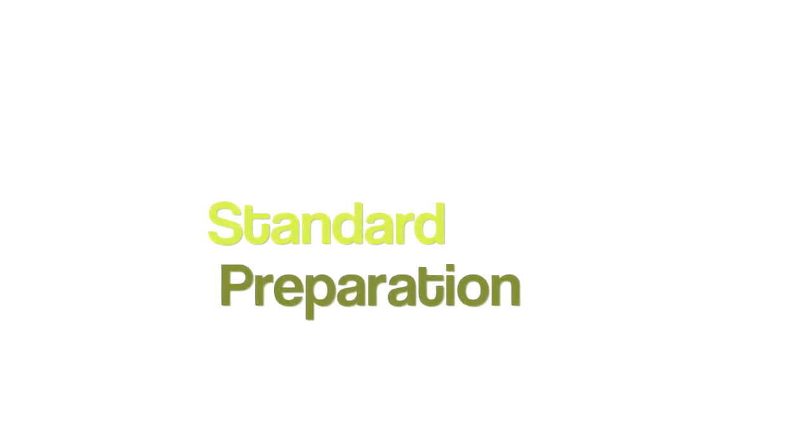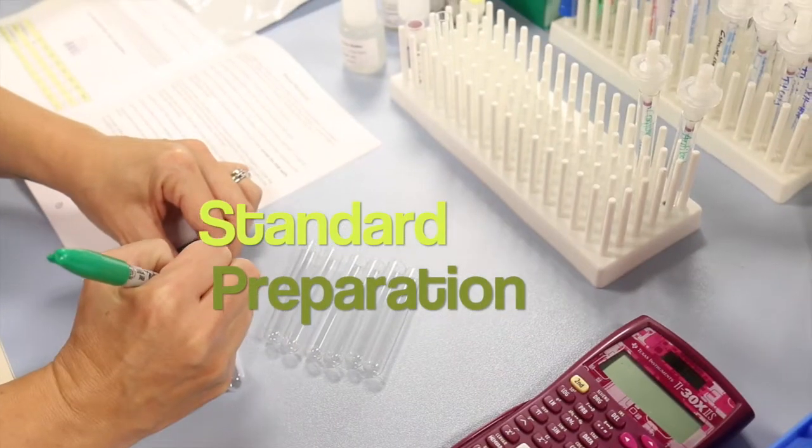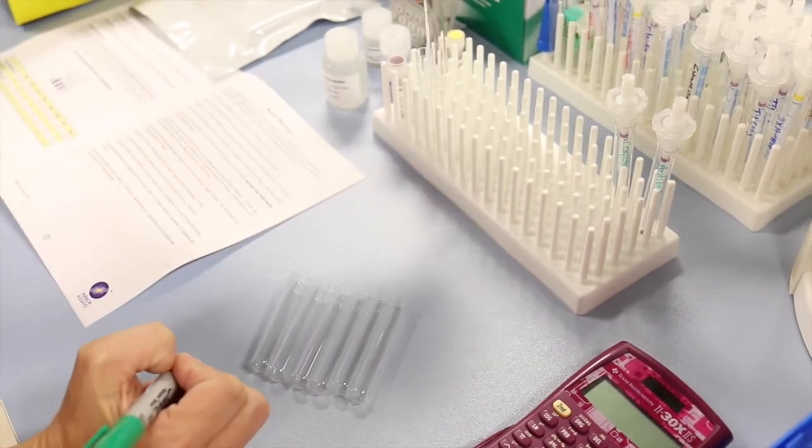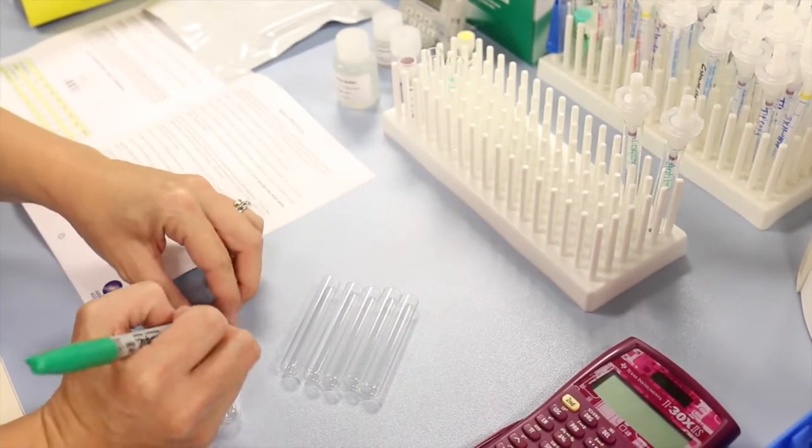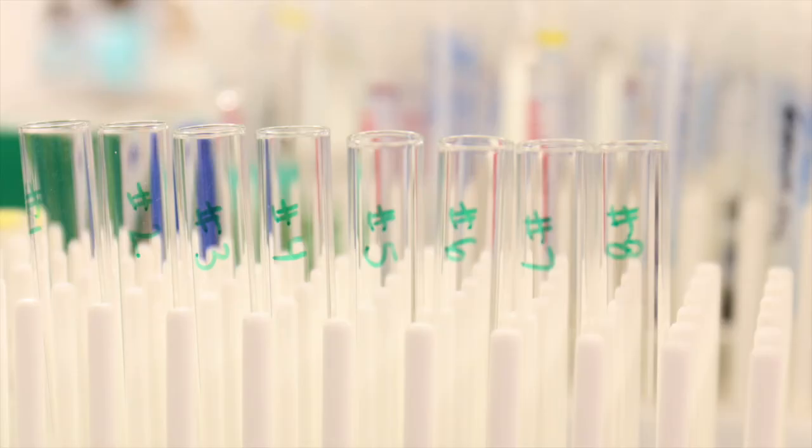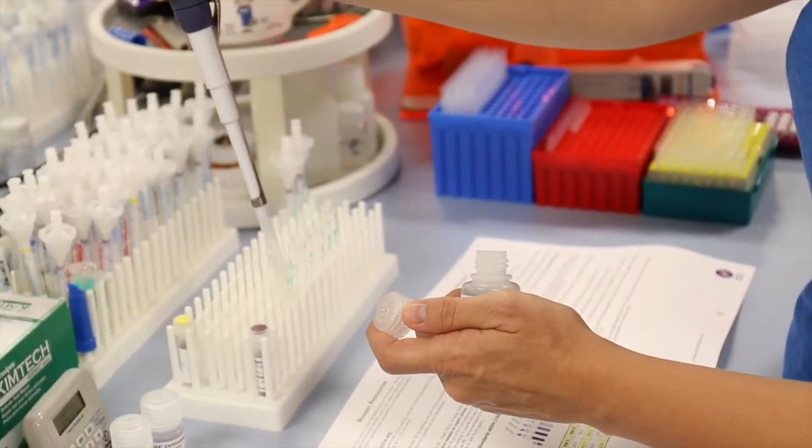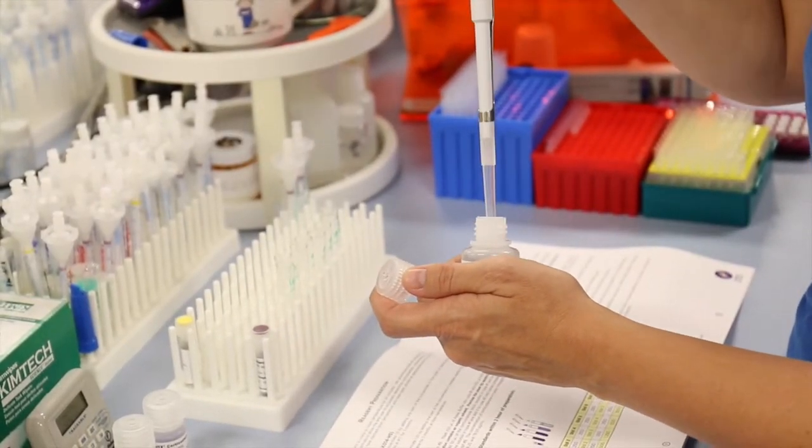For standard preparation, thoroughly read the standard preparation instructions in the kit protocol. Label tubes and add the appropriate volume of assay buffer to each tube.